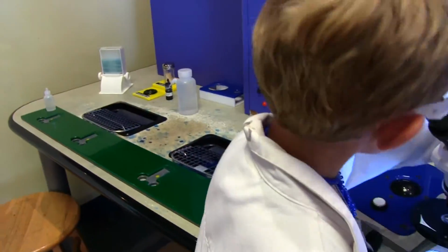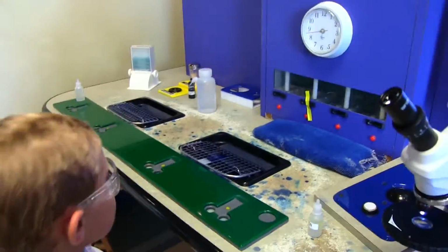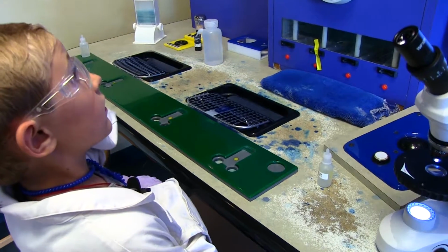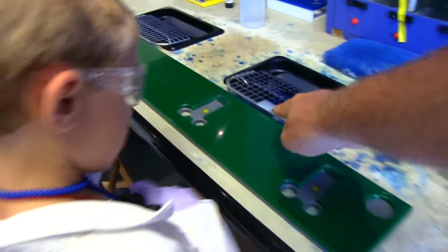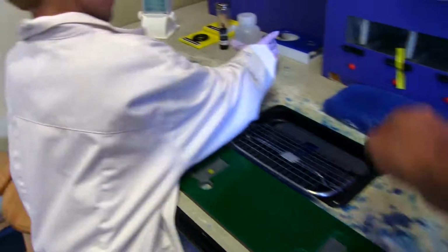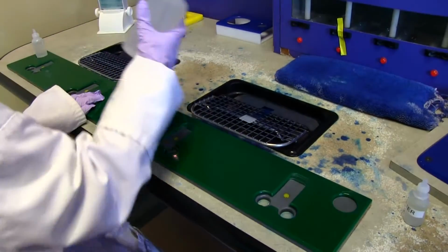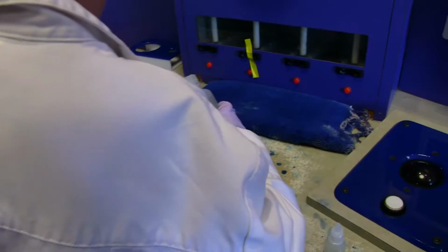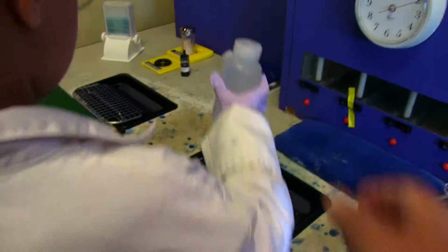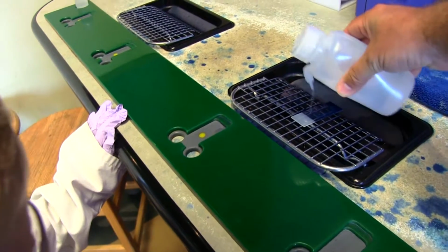Take the slide to the rinse area. To rinse the slide, squirt water over it. Okay. Can you move the slide down to the end here? Yeah, that'll work. Now squeeze some water on it. How much? Just a little bit until it washes it off. This much? Yep. Okay, like this.